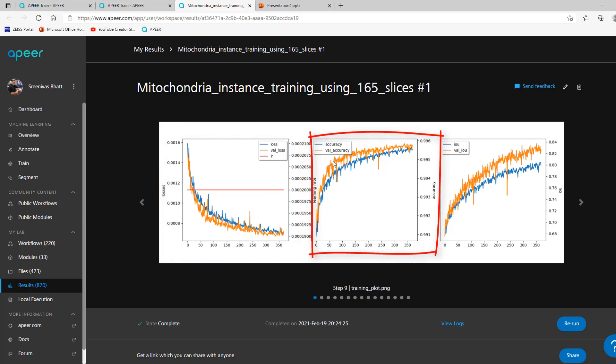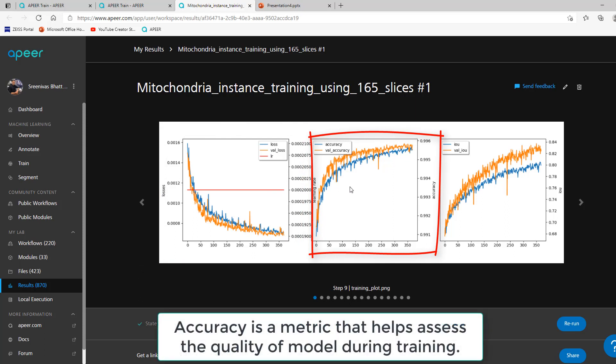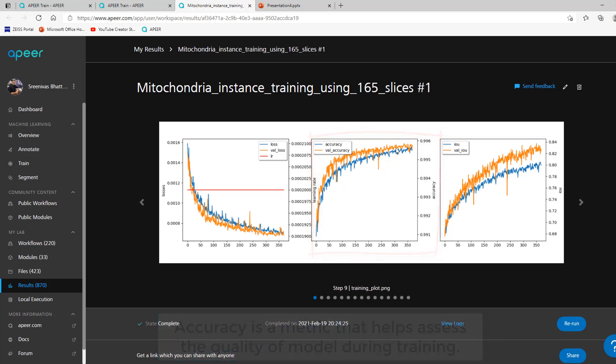Accuracy is a metric that our deep learning algorithm uses to assess model quality during training. This should trend upward, indicating that model quality is improving. Accuracy does not provide information on the quality of segmentation for each of the classes and background in your images.